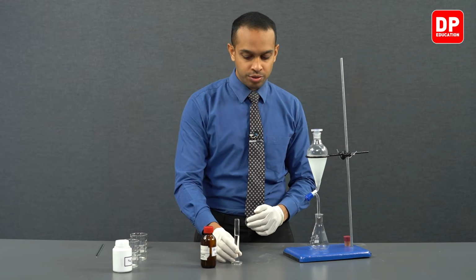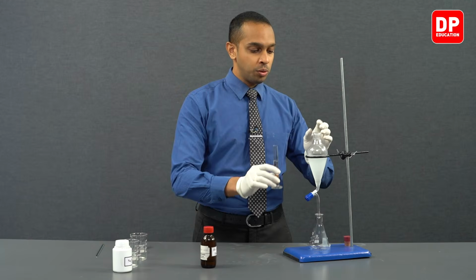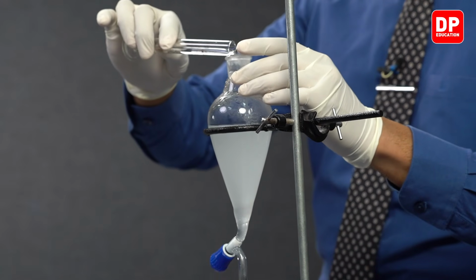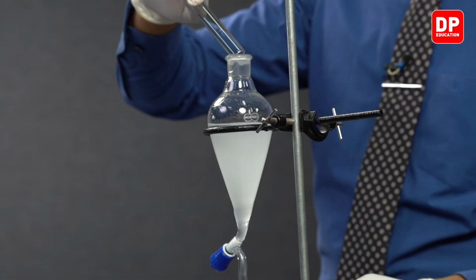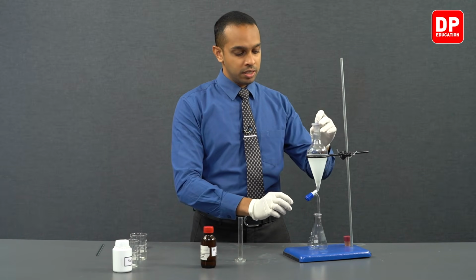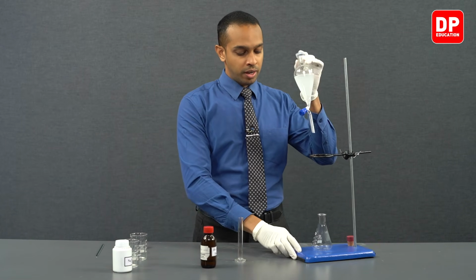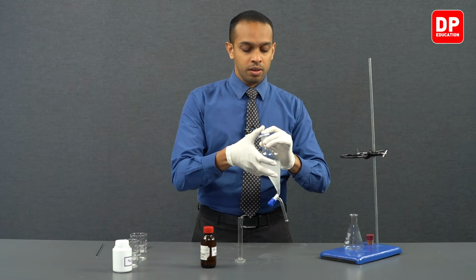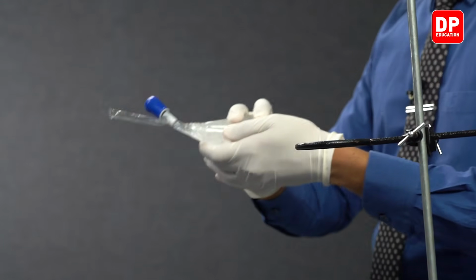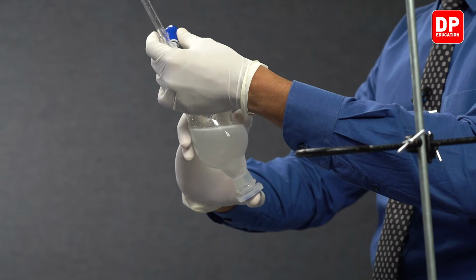Now we'll be transferring this 10 milliliters of diethyl ether into our separating funnel. After transferring it, we can close the separating funnel like so, and we will be shaking it so that it gets mixed really well. And students, don't forget to relieve the pressure every now and again.